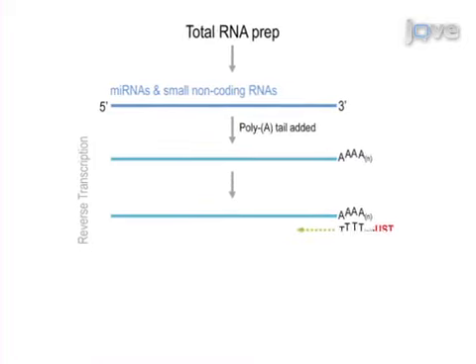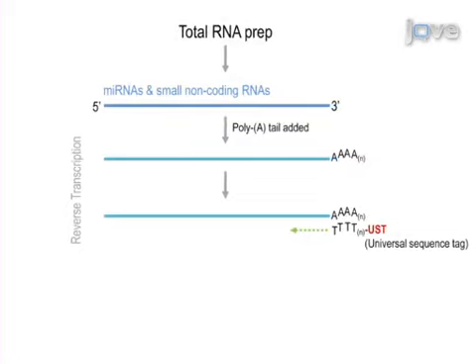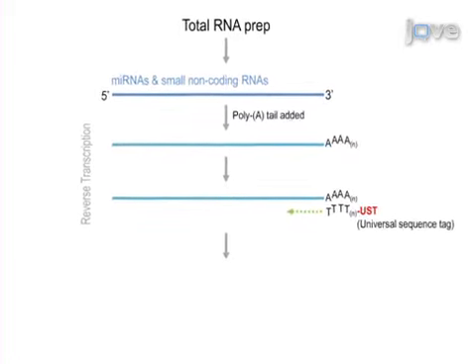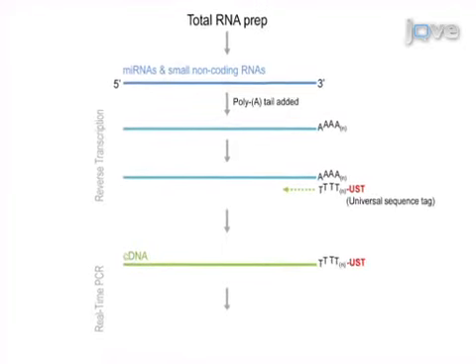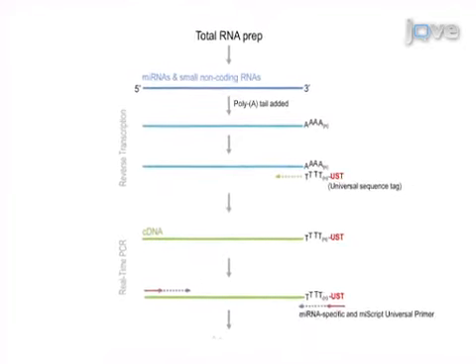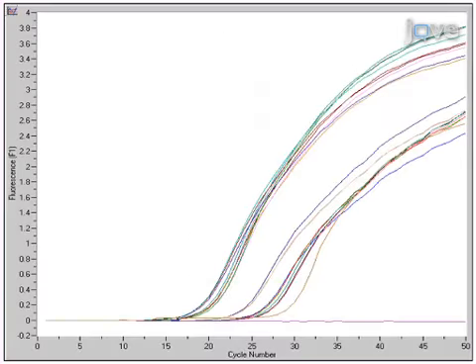Next, the RNA is reverse transcribed to generate cDNA. Then, SYBR Green-based real-time PCR is carried out using the cDNA as a template to amplify and quantitate microRNA expression in real time. Results are obtained that show relative expression of microRNAs in various prostate samples based on quantitative real-time PCR.